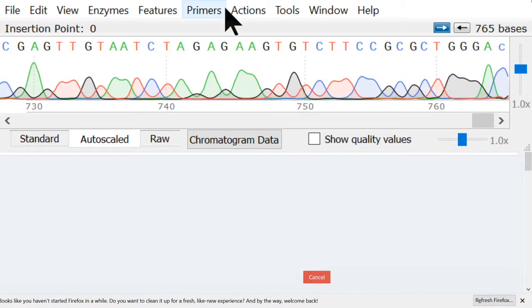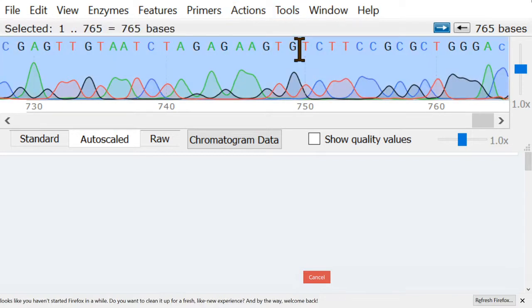So the next thing to do is to check this data, and the way I check it is I compare it with all of the closest matches in GenBank. So I'm going to select all and put it on the clipboard, and then we will open up Firefox.